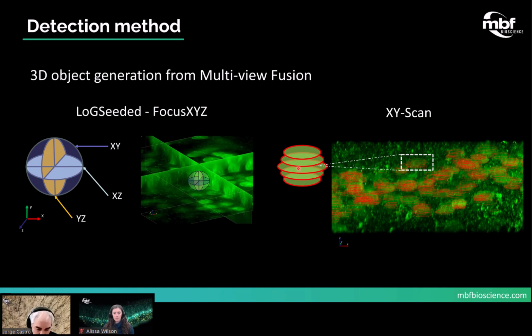And well, I mentioned centroids. Now that's something that I haven't mentioned before, but Stereo Investigator AI is using centroids as the counting particle. For the people not familiar with stereology, one rule while counting cells is that you have to determine a counting particle that is unique, but also present in all the cells you're counting. The convention here in classic stereology is to use the top of the cell as counting particle, as it is a very well-defined event when it starts showing up as you progress down the sample.